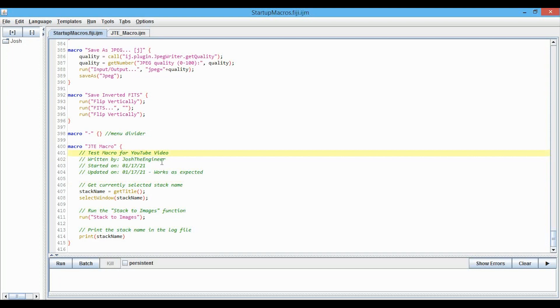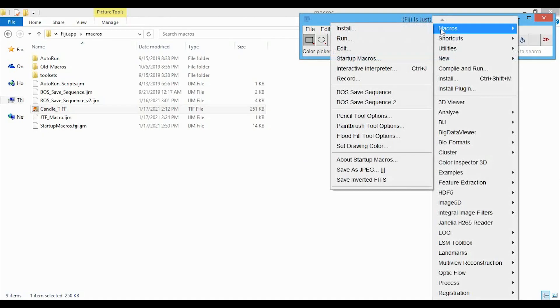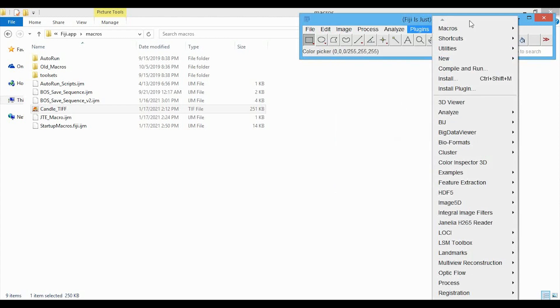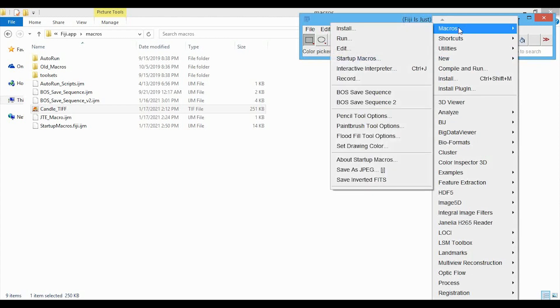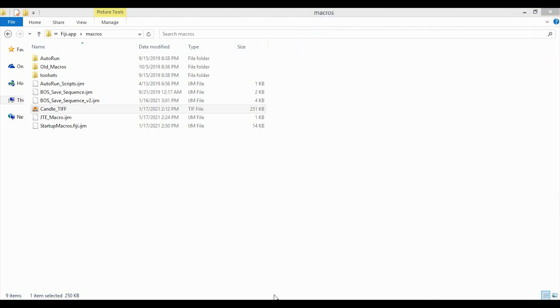And then now we can restart ImageJ. So we can see right now, first, before I restart, it's not there, right. We still have that divider in here, but the macro's not there, so I'm just going to close it and then I'm going to open it again.